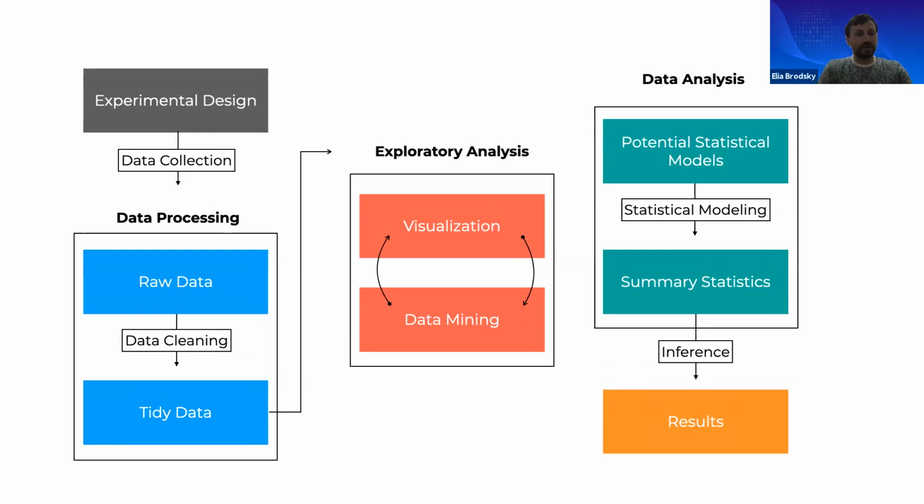Many times when that data is collected, it is provided to you in this raw format. And this raw format, just like we saw with FASTQ files, is not anything that you can analyze. Essentially, it's just short sequences of reads. If you wanted to align them all to each other, you would fail because they come from completely different places of a genome. And so the first process is called data cleaning. And it's typically assumed that a bioinformatician or a data scientist will spend probably between 70 and 80% of their time just on cleaning and processing that data. So when you do data processing, it's important to understand what type of unwanted variation you want to eliminate. So what's noise? What kind of signal you want to preserve? So how do you want to represent the signal in your data?